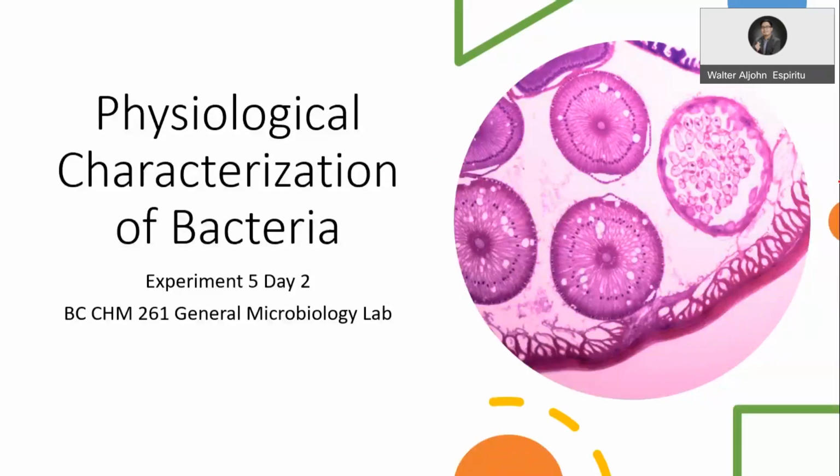For this particular video, I will discuss the second part of experiment 5, which is on the physiological characterization of bacteria. Last week you finished the cultural and morphological assessment and characterization of your unknown bacteria. But for today, we're going to have the physiological characterization of bacteria.